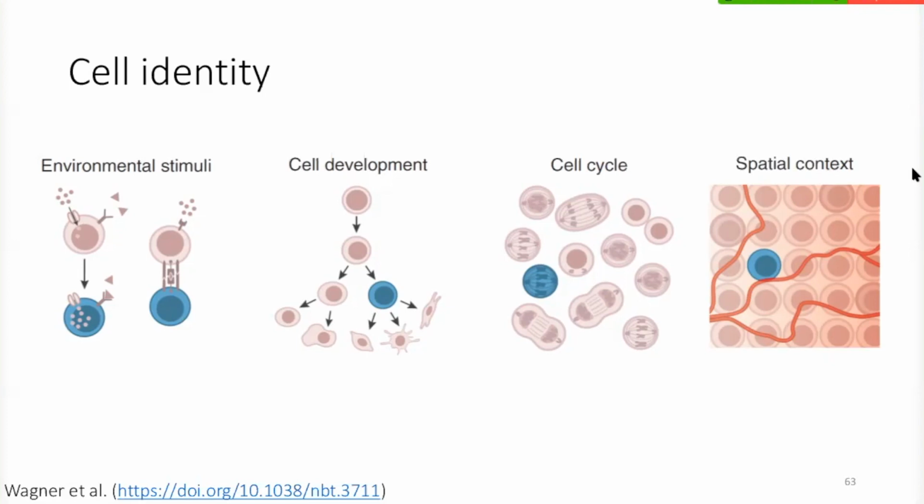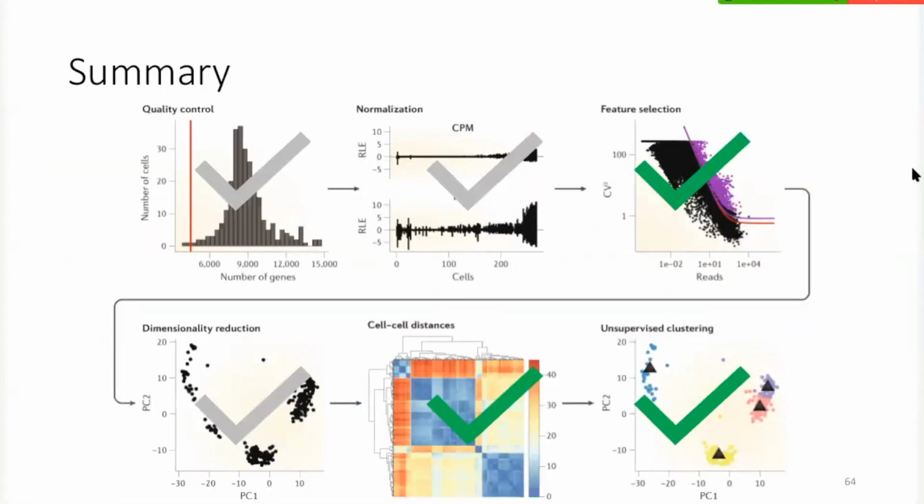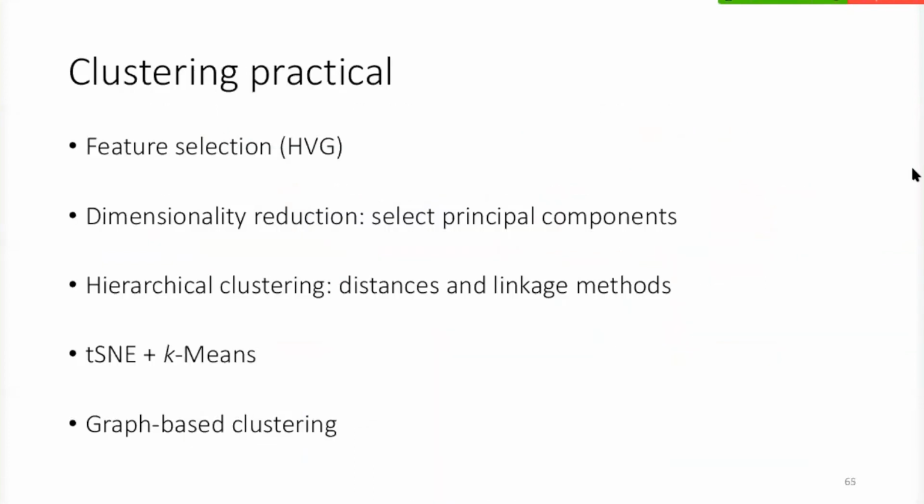But there are also other approaches. If you're doing patch-seq, for example brain patch-seq, then you can also look at recordings of the neurons. So try to always think about a different independent approach to validate the transcriptome-based clusters that you get. That's it. I hope we now covered the empty boxes in this plot.